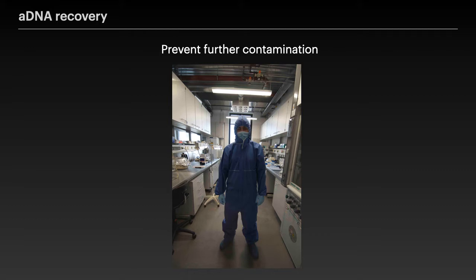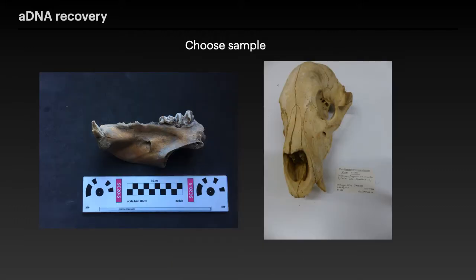Sometimes this is not possible, and of course we have to go on site at a museum or an office to do the sampling. But for a long time, scientists probably worked with what was available. So I guess rare or valuable samples would not be offered so easily, because of course there's a destructive process in the sampling where we usually use drills and destroy many of the characters of the original sample. So if I was, for example, to choose between two samples, I would probably pick the one that looks less degraded, but this is not a good criterion.